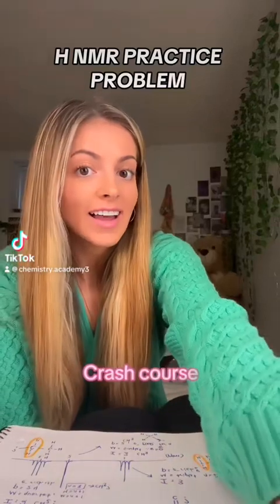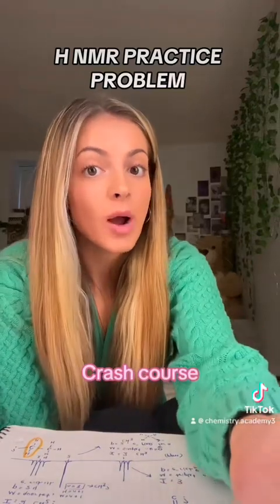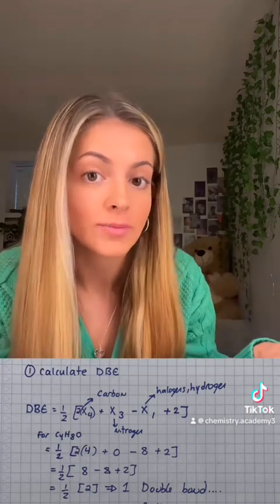This is how to analyze an NMR spectrum practice problem. Let's say the question says, determine the structure for the following spectrum. Step 1, calculate the DBE, double bond equivalence, using the formula. There's other formulas, but this is mine.